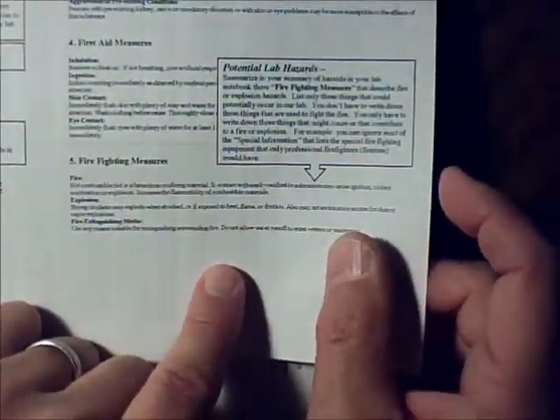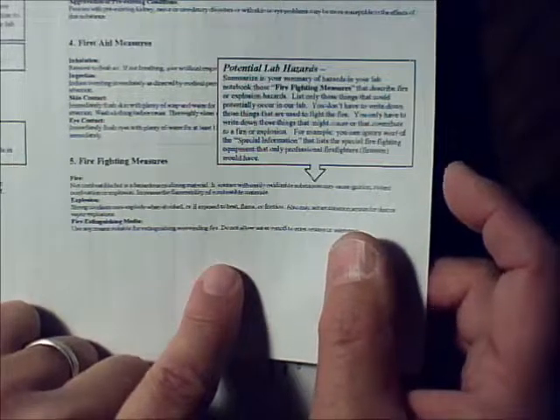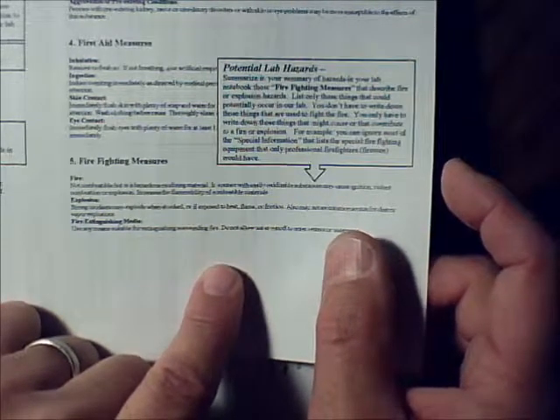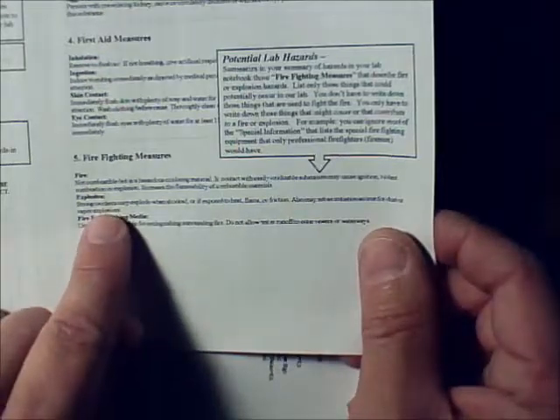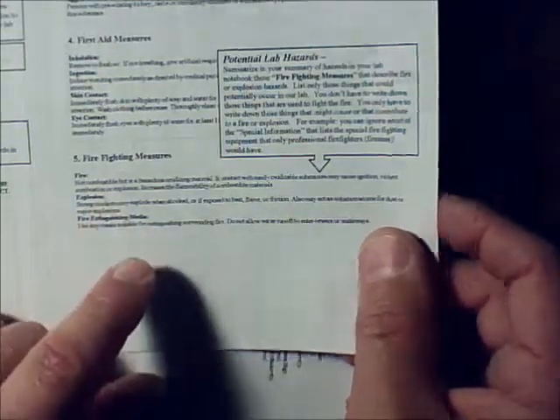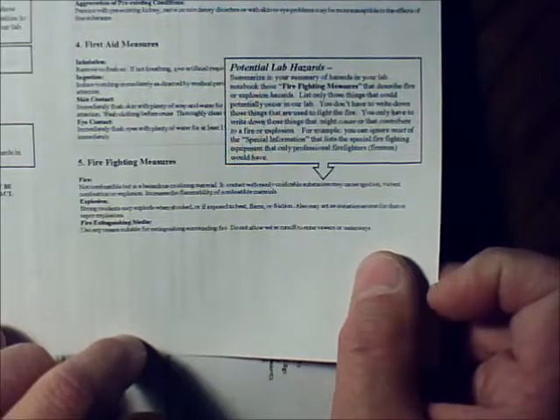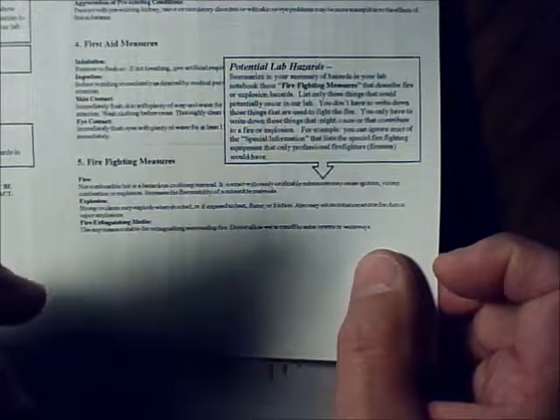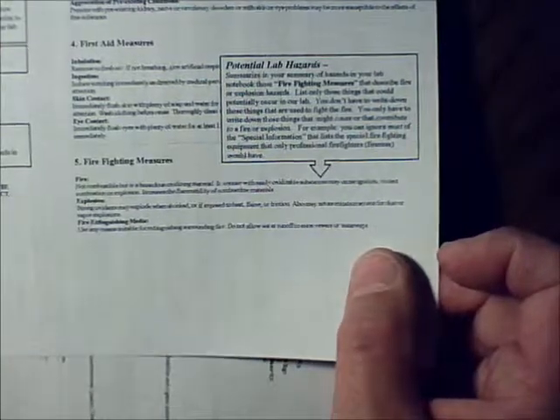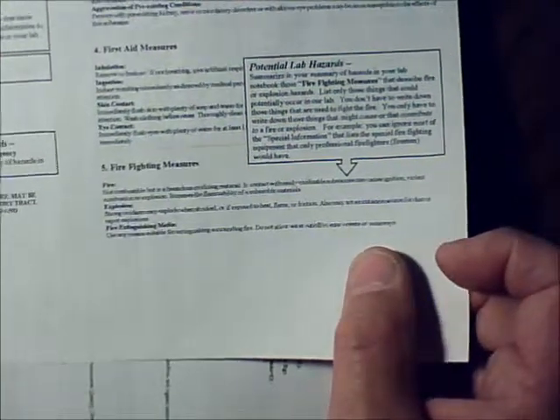Firefighting measures. It tells you what to do with firefighting measures. If it's not going to happen in the lab, don't write it down. But if things can happen in the lab, explosion dangers, fire dangers. Listen, you've got to say something about fire. If it can't burn, if it's not combustible, at least you've got to say that. Clear?